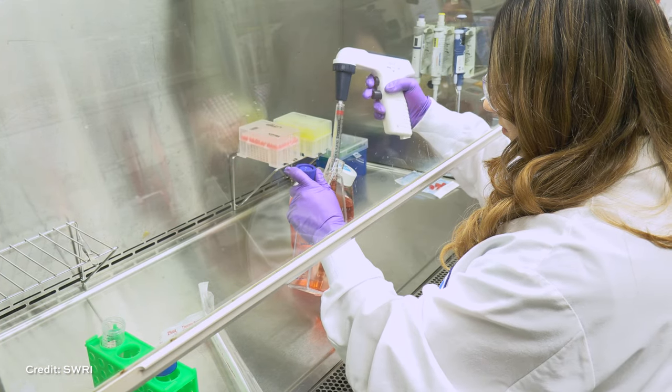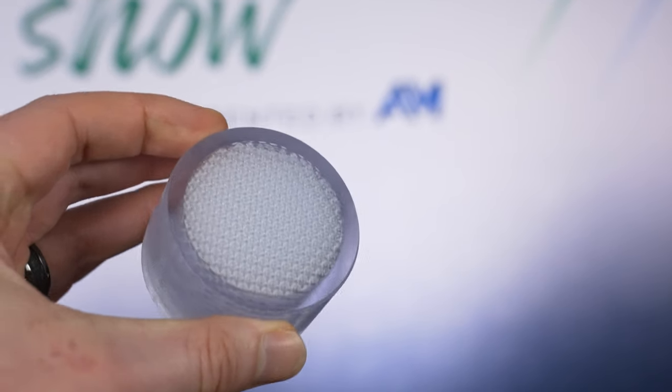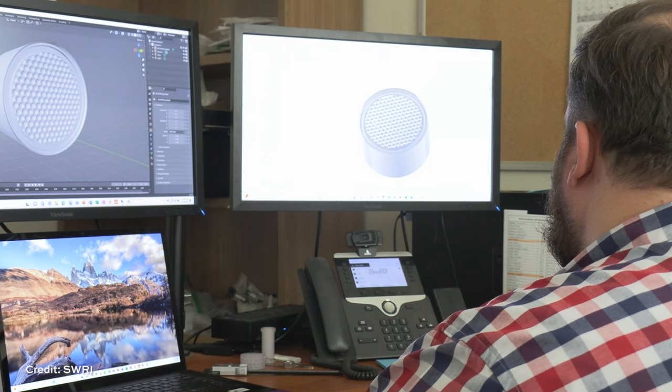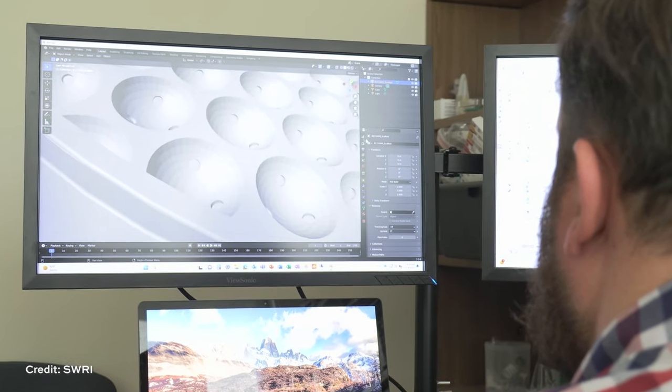As the cells multiply, you have to keep dividing them, keep moving them between containers. These 3D printed scaffolds are a possible solution, a way to get a lot more of that surface area into a much smaller size. It takes about a billion cells to get a quantity, a culture that is useful for one of these samples. But these cells, as they're growing, if they overlap, they'll begin to bond with one another, so you need enough surface to spread them all out. Complex, intricate geometry makes it possible to get all of that surface area into a small space to do this efficiently.